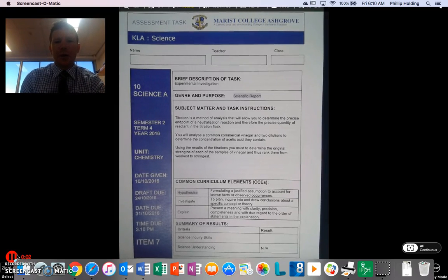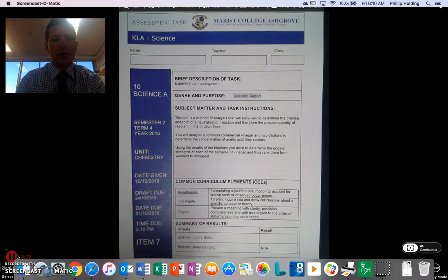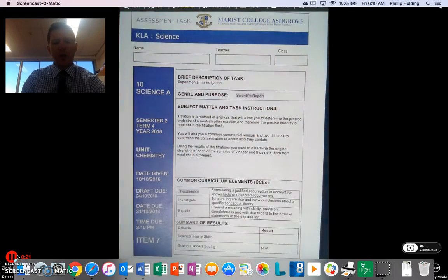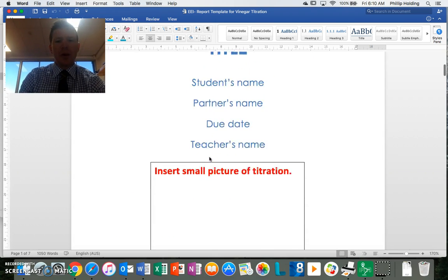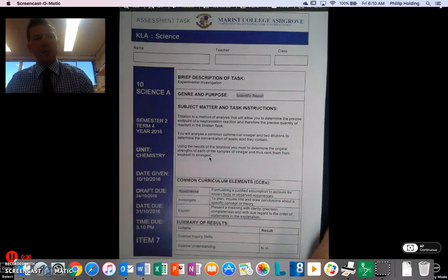Here is Mr. Holding, and this quick video is an explanation of your 10 Science A experimental report on titration, so finding the concentration of an unknown solution. There will be two things given at the start of the report. First is your task sheet, like always, and we're going to go through that in a moment. And the second thing is your report, a blank report with some guidance. So we'll go through both of these very quickly now to give you an indication.